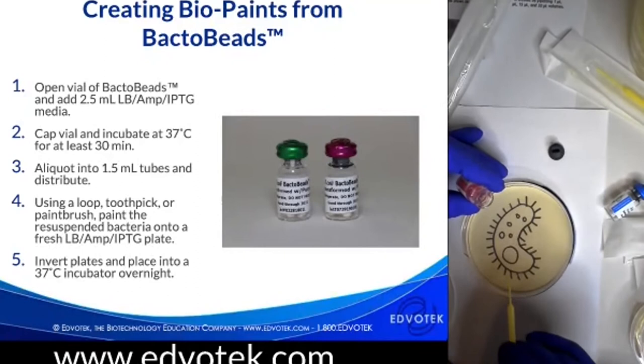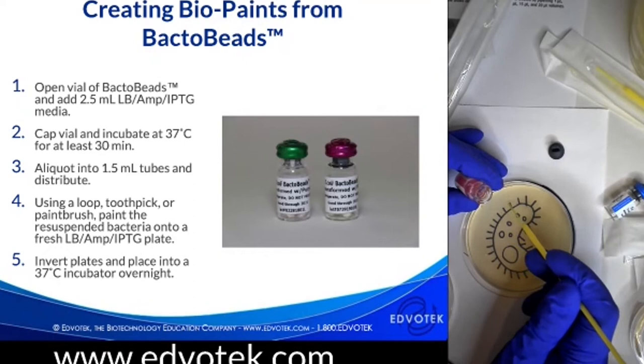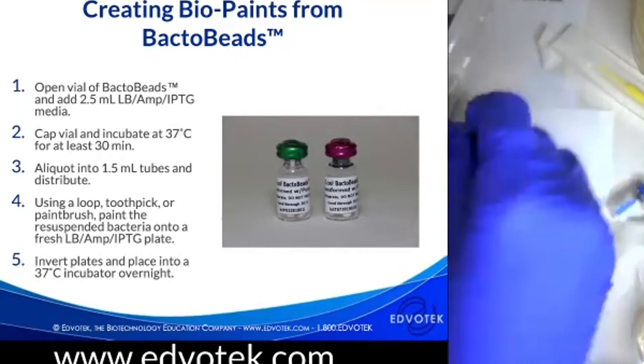Oh, I just stuck my finger. Good thing that these bacteria have ampicillin in them, because if there are any bugs on my hand, they will likely not grow on this plate. Of course, if you're in a classroom, you probably want to do this next to a flame or something, just to ensure that you are keeping an updraft to keep any extra stuff off of the plate.